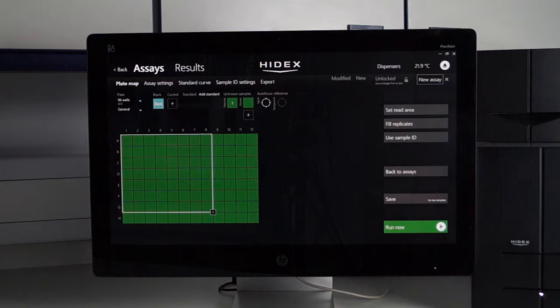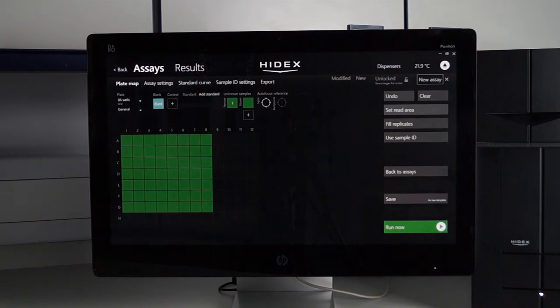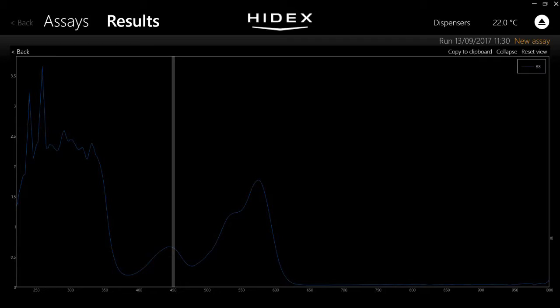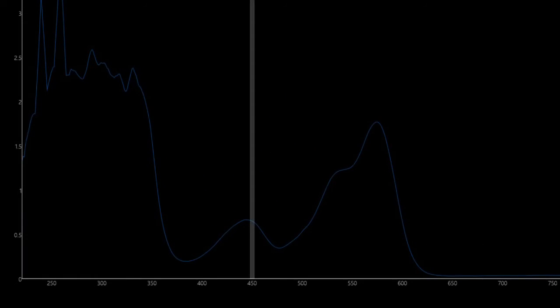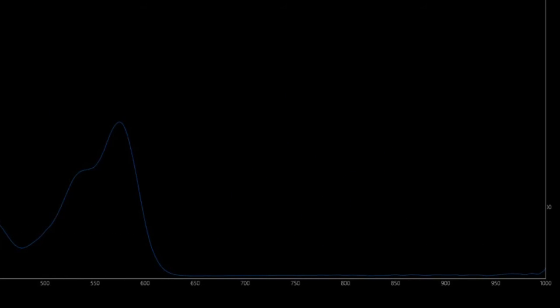Many plate readers on the market use a specific optical filter to measure absorbance, however the HydexSense uses a spectrograph which is capable of reading the samples across the full wavelength spectrum of 220 to 1000 nanometers.